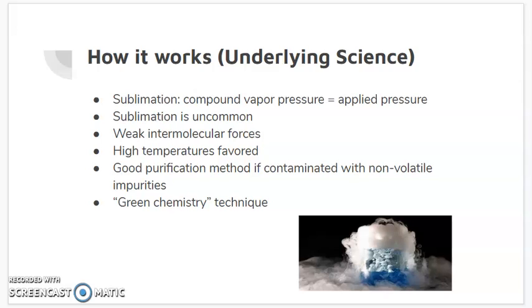Sublimation is also called a green chemistry technique because no solvents are used and no waste is generated in the process. The picture demonstrates what sublimation looks like in action. The most common example of a sublimation is dry ice and CO2. The CO2 goes directly from the solid phase to the gas phase with the addition of water, for example, which speeds up the reaction and causes that white eerie gas to form.